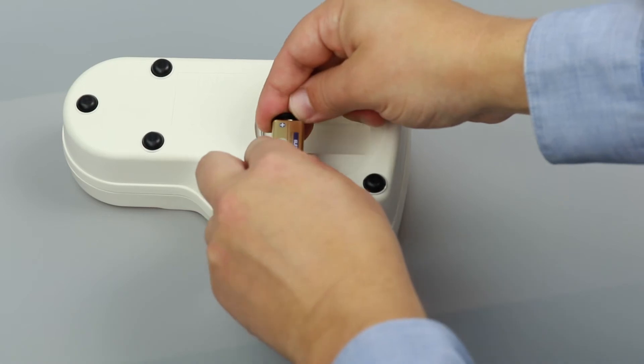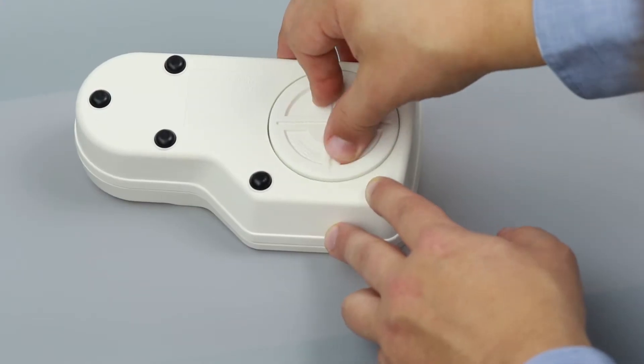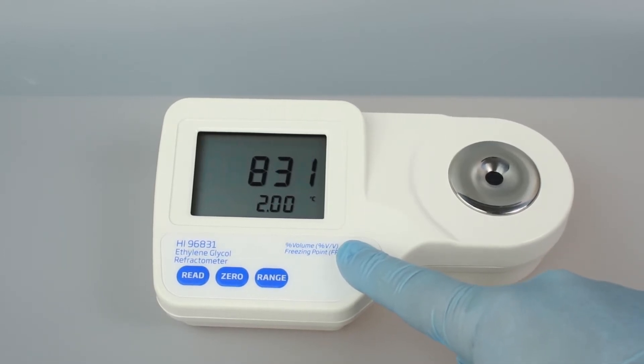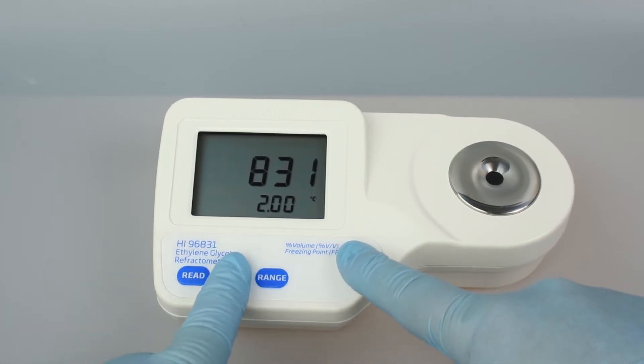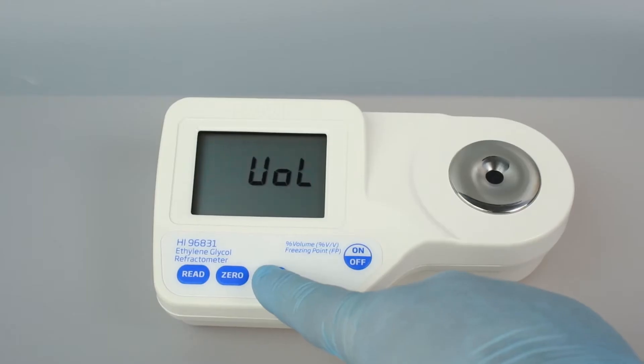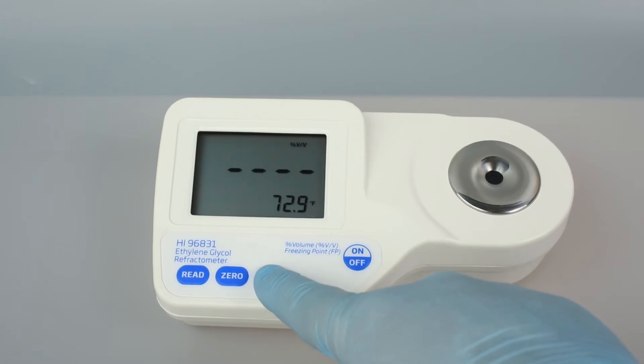To set up your meter, install the 9-volt battery in the compartment. To select your temperature units, press and hold the on-off button until the screen flashes, then continue holding on-off and press zero to change from Celsius to Fahrenheit. To change the measurement units, press the range button until your desired unit appears in the top right corner. This meter measures in percent by volume and freezing point.